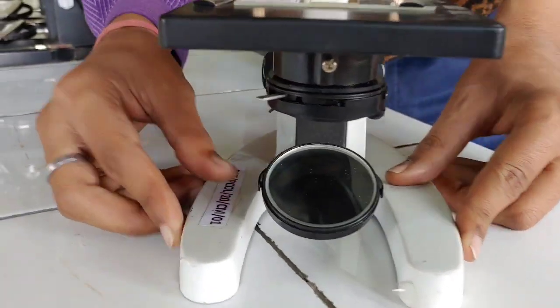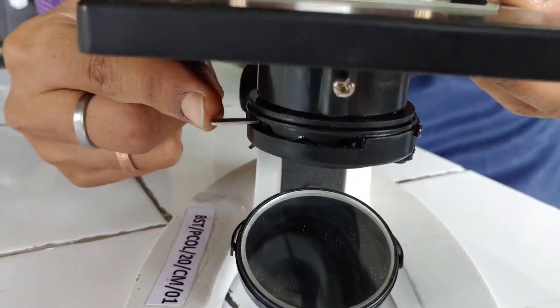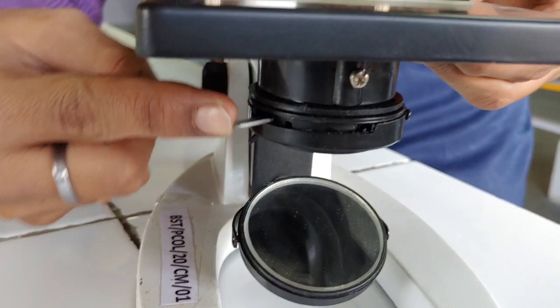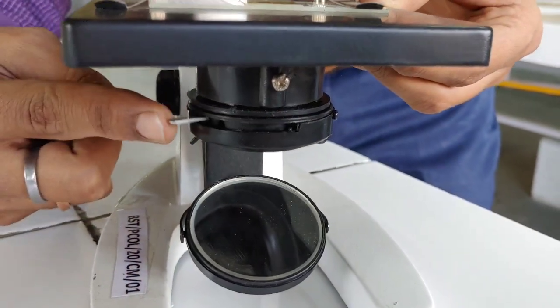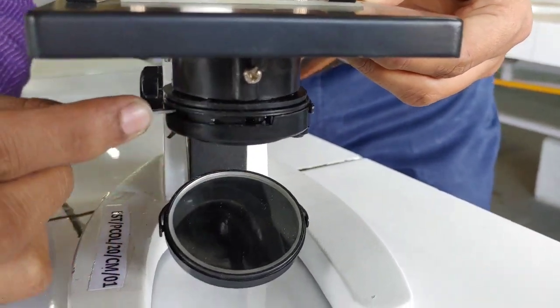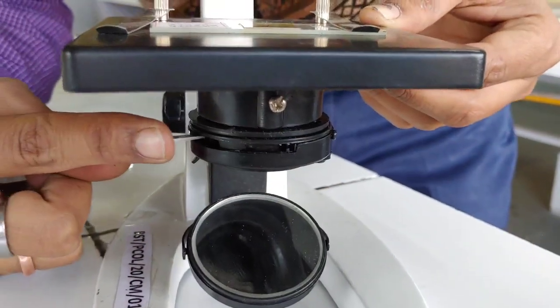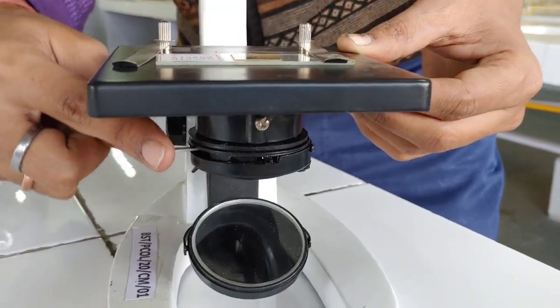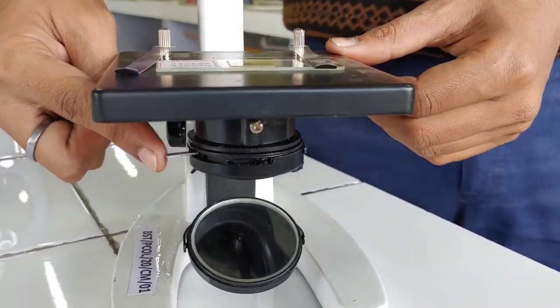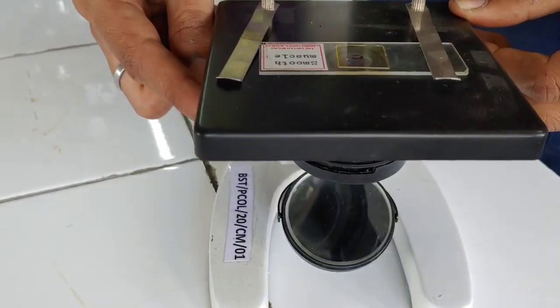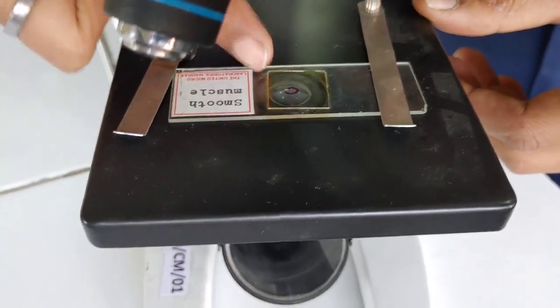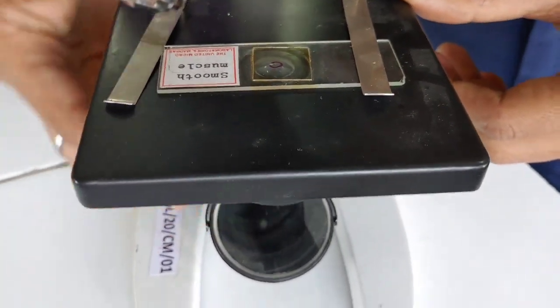Next is condenser. You can see in the video, a condenser is there. It is a system of lens which is fitted as a short cylinder mounted below the stage. This condenser helps to focus the light on the specimen which is over the stage.